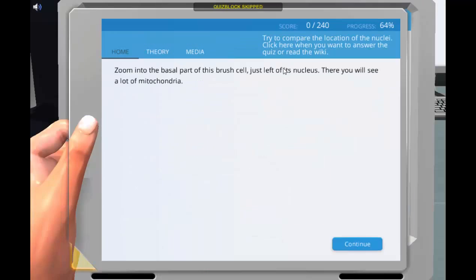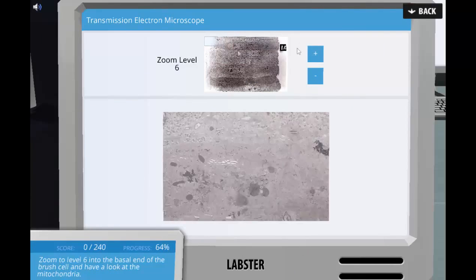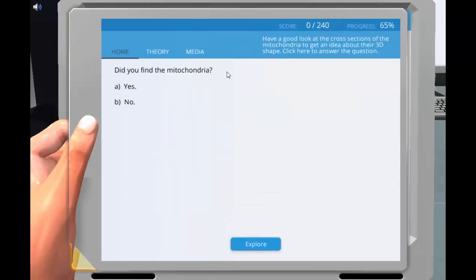They can zoom in and out and observe different cellular structures, for example, the microvilli, mitochondria, and the junctions between cells.